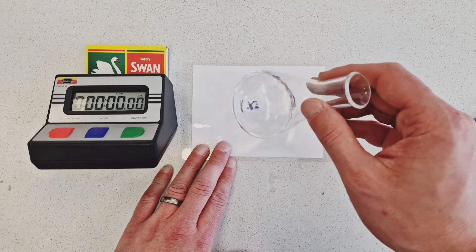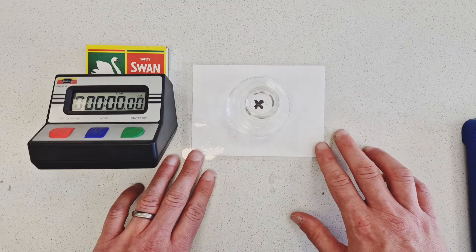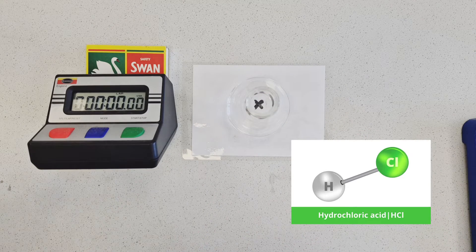This conical flask contains a colourless chemical known as sodium thiosulfate. Now, sodium thiosulfate is able to react with hydrochloric acid.